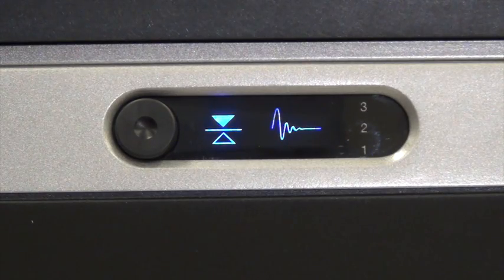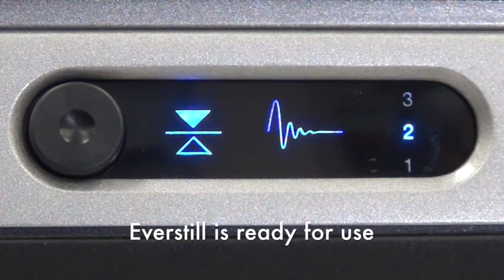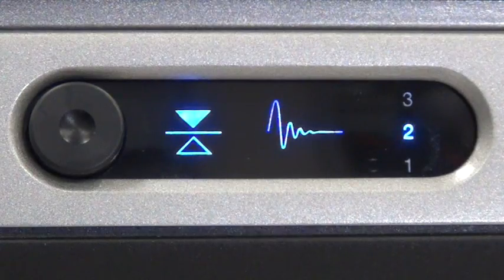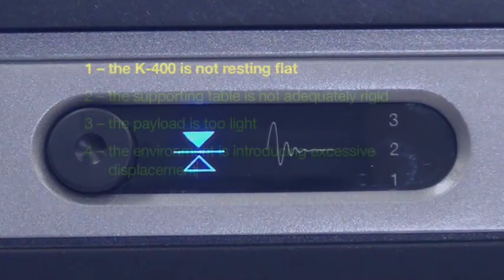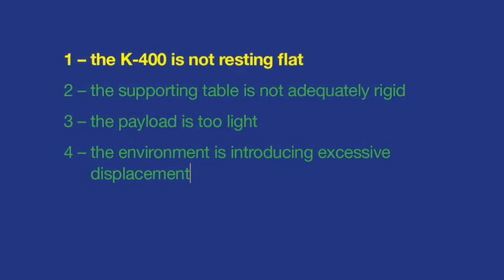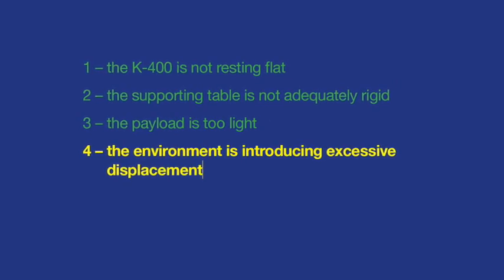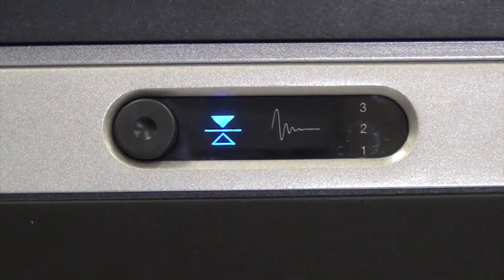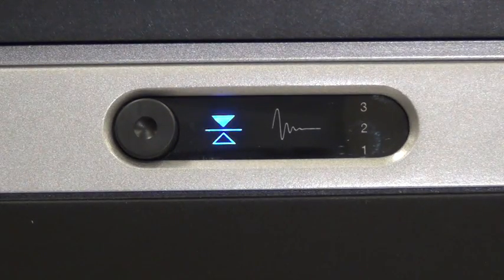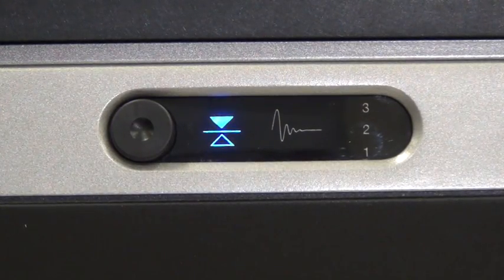The system is ready for use when both indicators and the gain-match setting are solid. If the isolator indicator and gain-match setting do not illuminate at the end of the startup self-test, this indicates that the K400 is not resting flat, the supporting table is not adequately rigid, the payload is too light, or the environment is introducing excessive displacement. Restart the K400 when these conditions are corrected or eliminated. Contact TMC for the optional load plate and support table options.